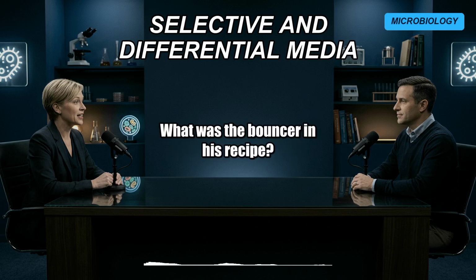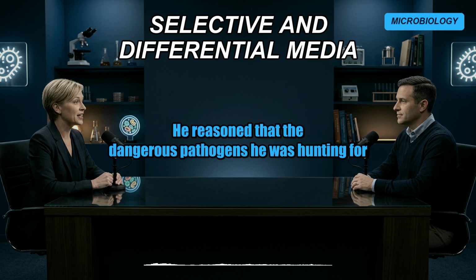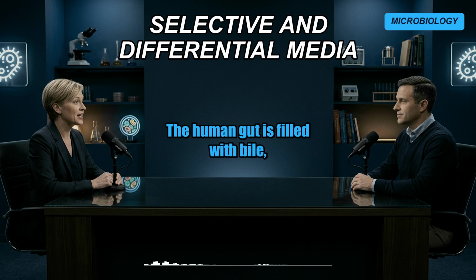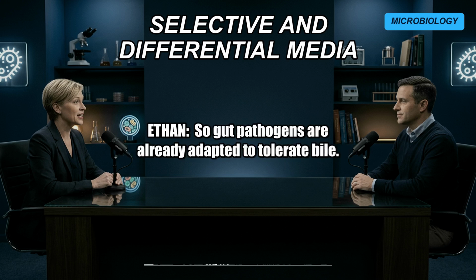What was the bouncer in his recipe? So, MacConkey used bile salts and crystal violet dye. He reasoned that the dangerous pathogens he was hunting for, like Salmonella, naturally live and infect the human gut. The human gut is filled with bile, which acts like a harsh detergent, basically tearing apart the lipid membranes of many bacteria. Okay, so gut pathogens are already adapted to tolerate bile.